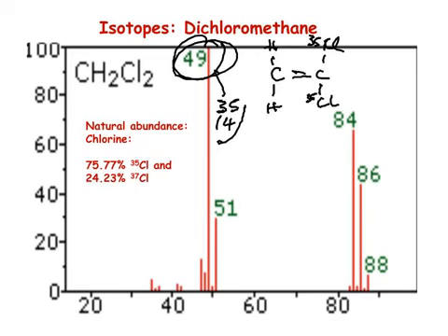areas I don't fully understand myself here, but that's leading me to think in terms of a carbon which is 12 plus 2 hydrogens. The other 2 would come from H and H. So whether it fragments and then rearranges in some way, so that perhaps you had ended up, because of fragmentation and rearrangement, with that kind of particle there, that would indeed have 12 and 2 is 14, and 35, giving a total of 49, which would explain that peak.